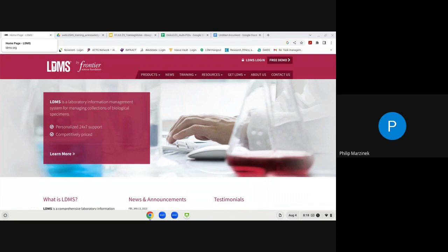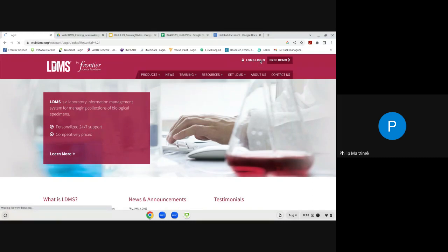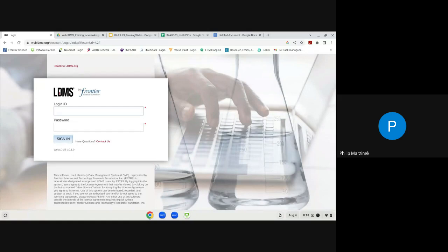This is our ldms.org website. To access LDMS we can go to the ldms.org website in your browser of choice and click the LDMS Login button. We recommend Mozilla Firefox, Google Chrome, or Microsoft Edge — these are the three browsers the Web LDMS platform is validated on. If you are a new user, you will have received a login ID and temporary password from LDMS. That temporary password is only good for 24 hours, so if it has expired you will need to contact User Support for a new one.